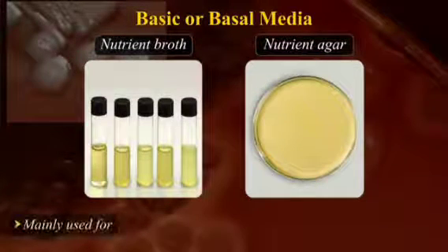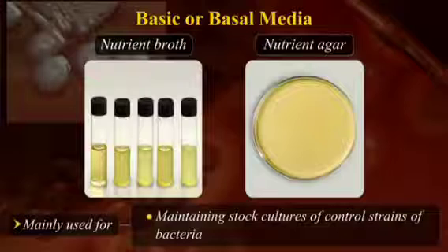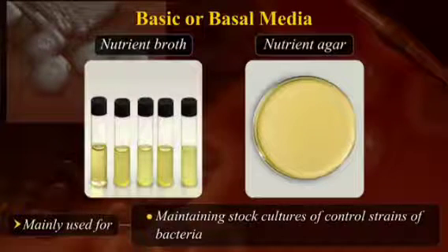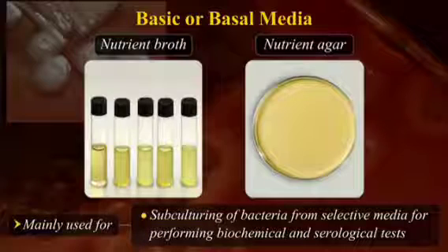These are mainly used for the preparation of enriched media, for maintaining stock cultures of controlled strains of bacteria, and for subculturing of bacteria from selective media for performing biochemical and serological tests.